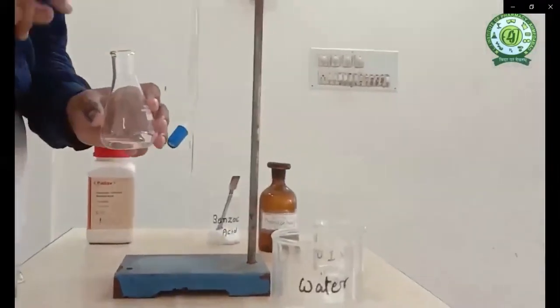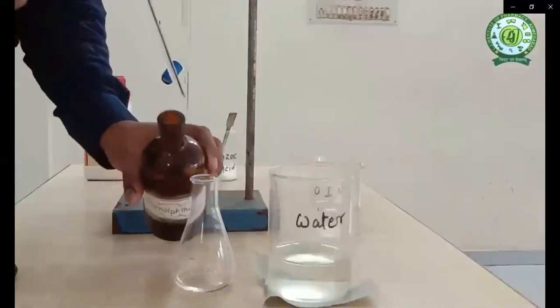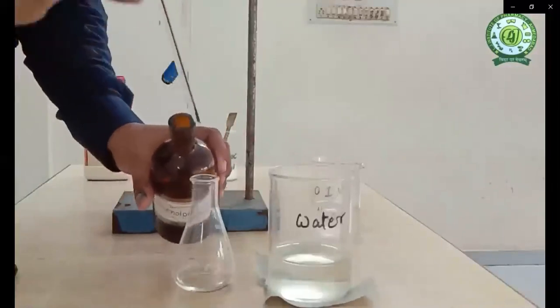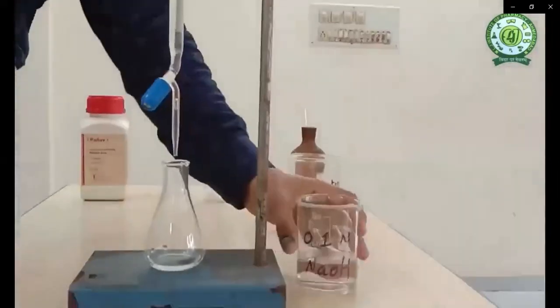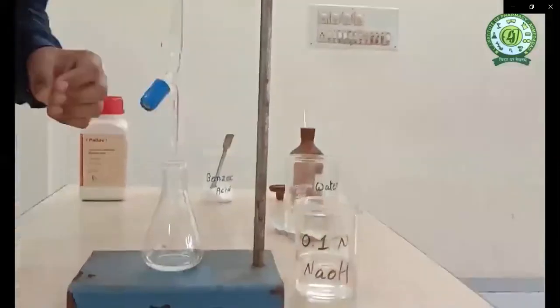Now for this titration, we are going to use phenolphthalein as an indicator, so I'm going to add 2 drops of phenolphthalein indicator. For titration, we are going to use 0.1 normal NaOH, which is prepared.